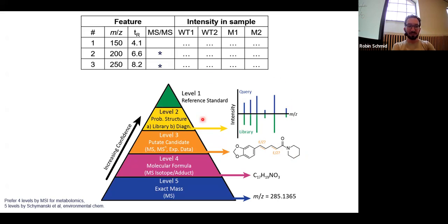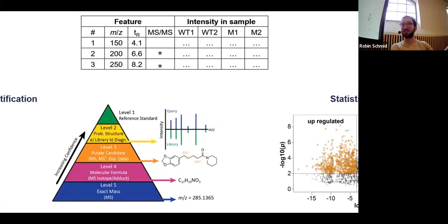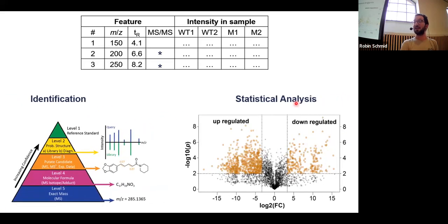But still, in both of those schemes, it's very hard to say where in silico tools fit in, like SIRIUS, for example. It's very hard because they are not really covered by the examples that they have. And so we would just say, provide a table and do as good as you can, and just say, okay, we had a reference compound for this one, we did not for this one. We do have MS2 spectral matching, we match the retention time to databases and so on.